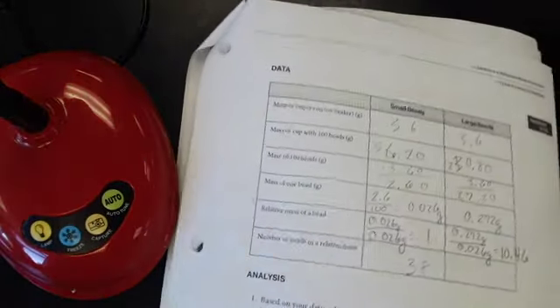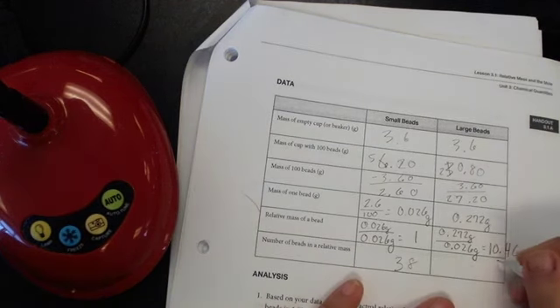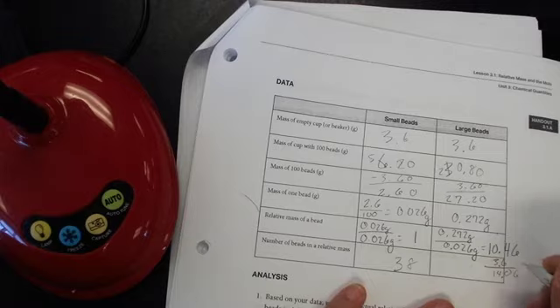So again, here, I know that my cup is 3.6 grams. So I know that I need my mass to come out to 14.06.